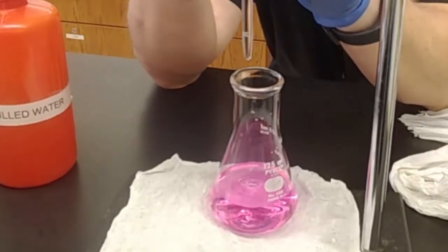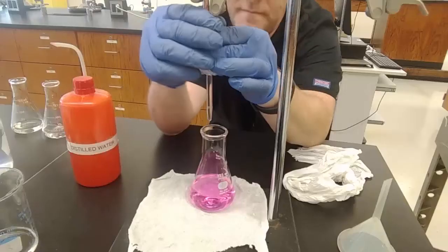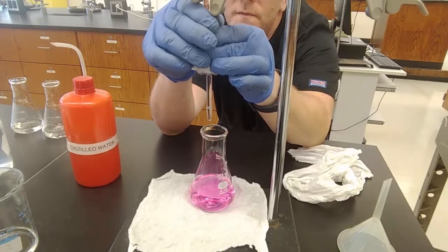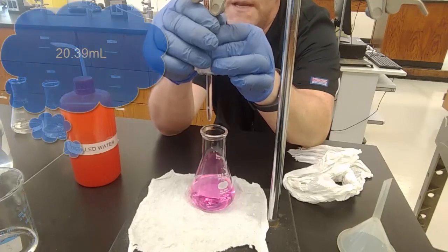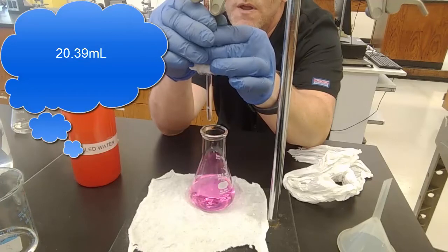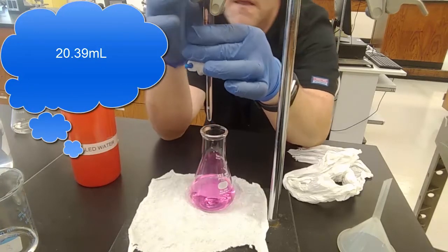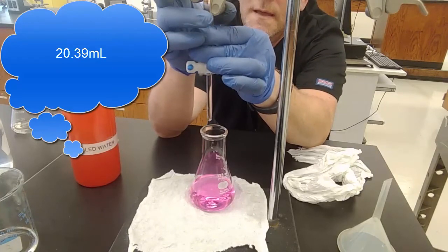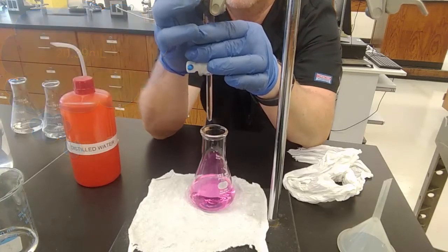I'm between 20 and 21. I'm between 20.3 and 20.4, but really, really close to 20.4. So I'm going to call this 20.39. Yes, 20.39. So minus the 3, we're at 17.39 milliliters.